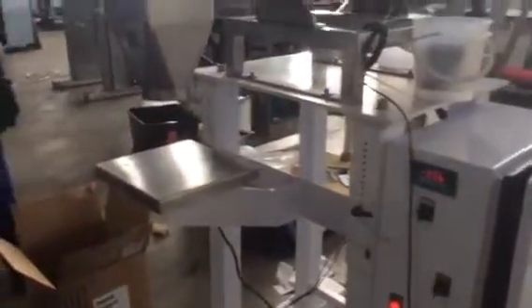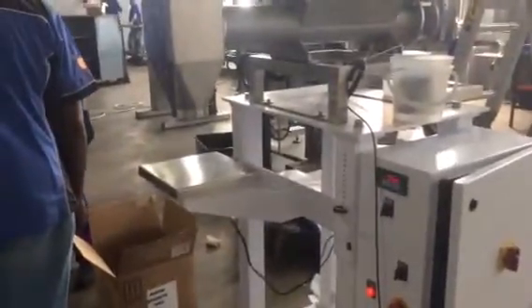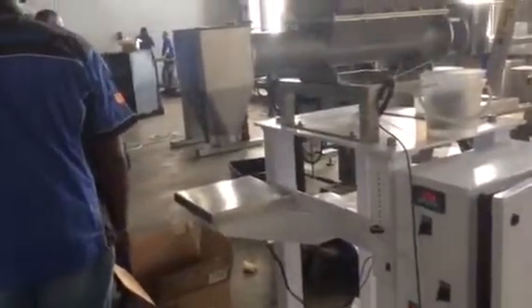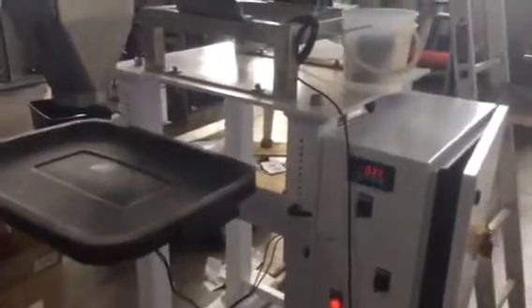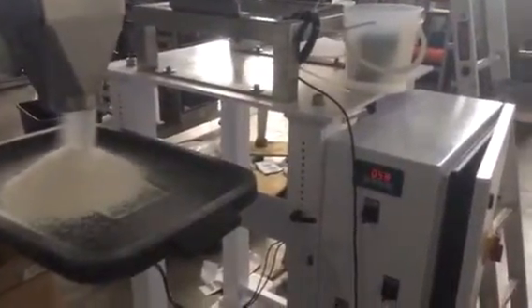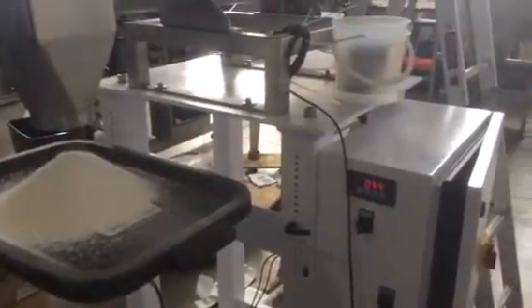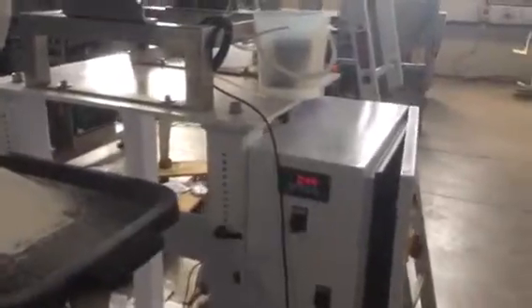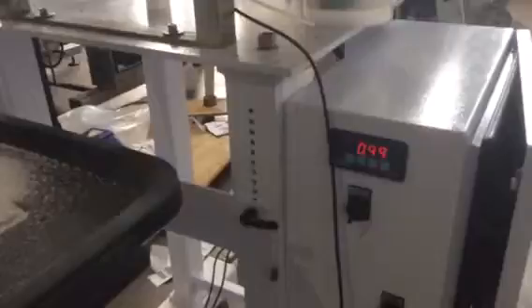And number three coming up in a moment. Zero there and here it comes. And once again within one percent, or even probably half percent.